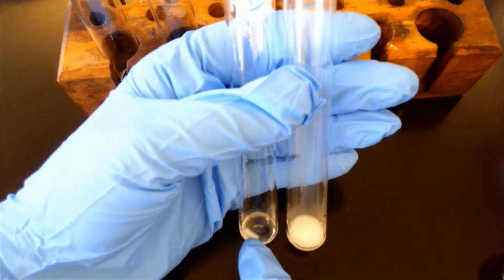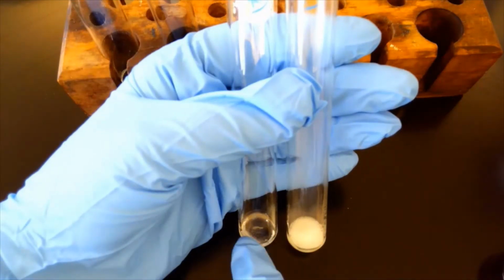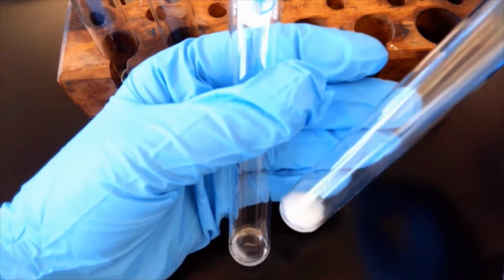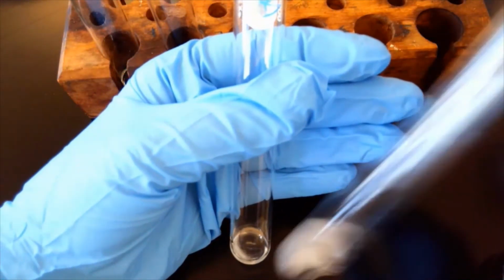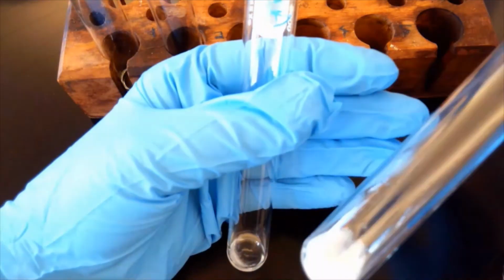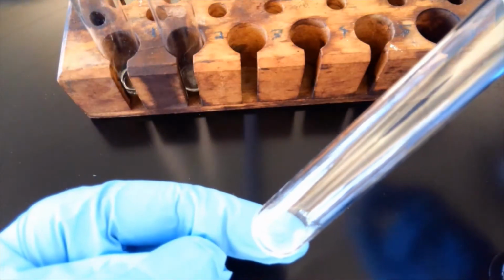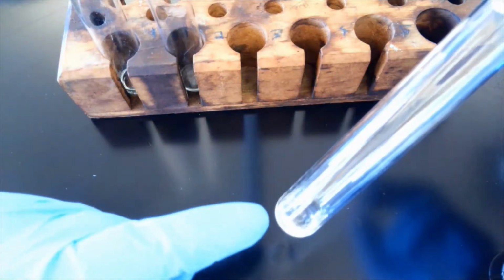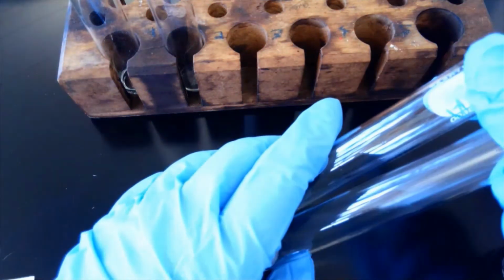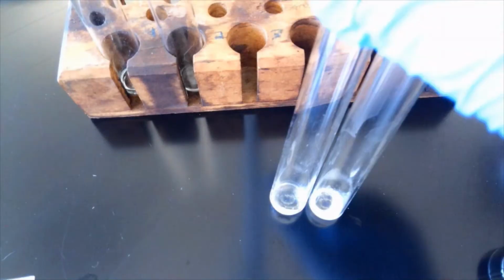So here we have again our 6 molar acetic acid, and then our 6 molar HCl. If we're looking at our HCl, it's all bubbles. I hate to tell you, for the most part, that piece of metal is almost gone. And then if we're looking over here, we still have our metal strip. Again, hot, but not nearly as hot. Bubbling vigorously, just nowhere near as vigorously as the 6 molar HCl. So the strength of the acid does matter.